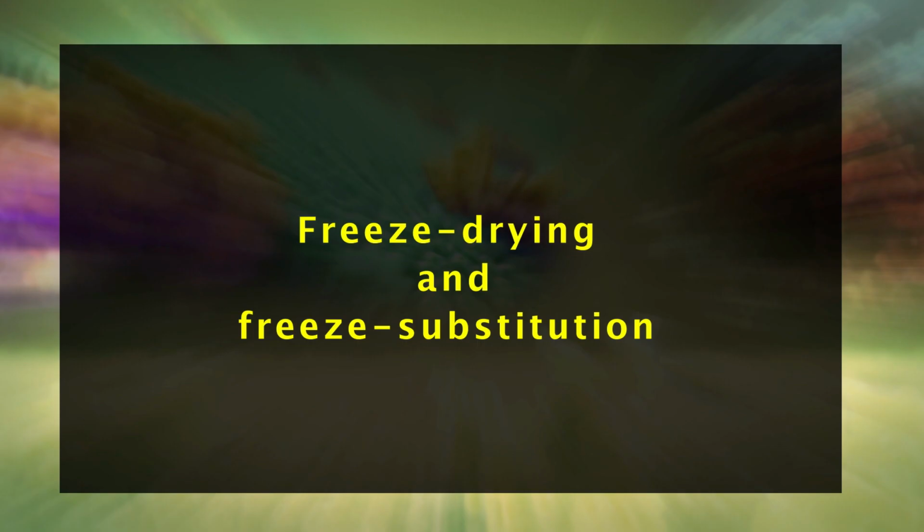Dear students, now moving on to the another objective, that is freeze drying and freeze substitution. Freeze drying method. This method consists of rapid freezing of tissues followed by dehydration in a vacuum at a low temperature.